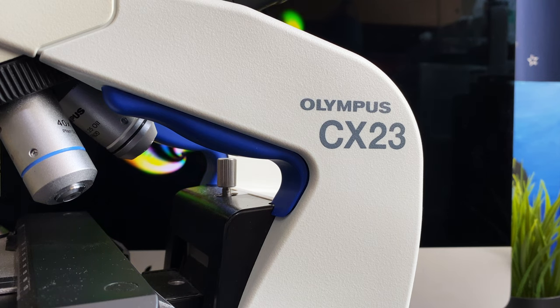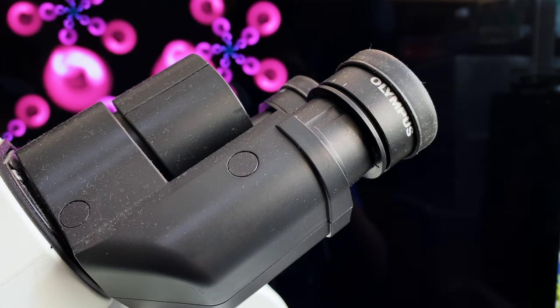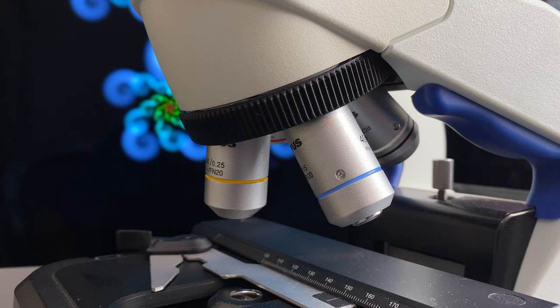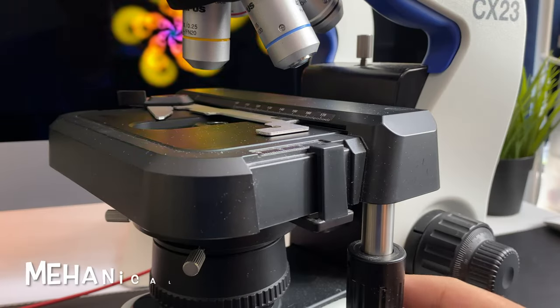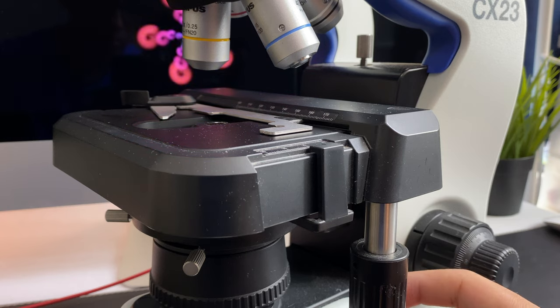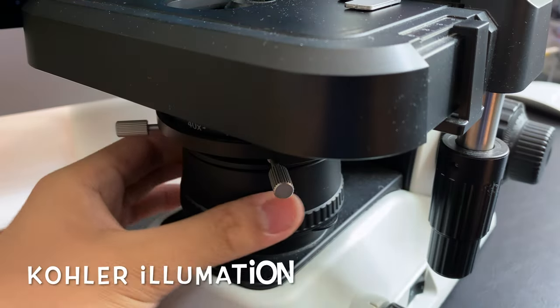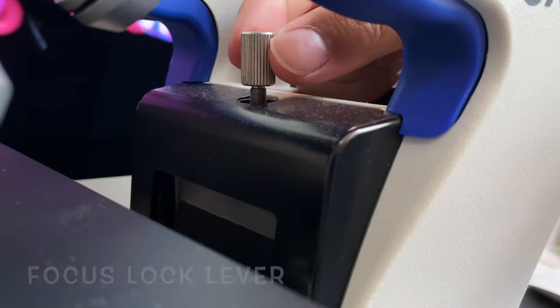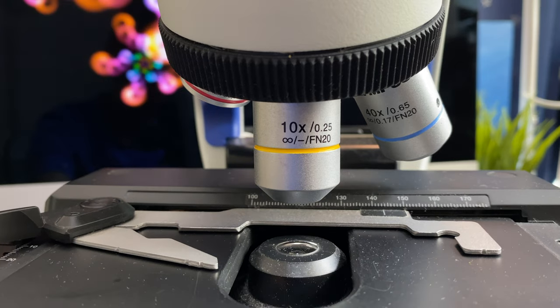As for the Olympus CX-23, this is a more professional microscope, so it has a binocular eyepiece with two eyepieces, four objectives including a 100X oil immersion one, a mechanical stage for more precise control of your specimen, a better illumination system for improved image quality, and a focus lock lever to prevent you from damaging the objectives.